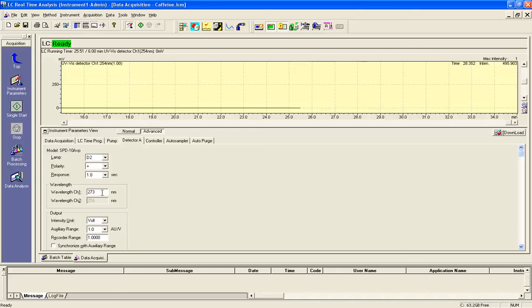Okay, well, if I need to change it, what I do is I just highlight it and I go maybe to 254. And I just key it in. And it's okay. That's all that I need to do for now. You just key it in. So maybe I'm looking for something like benzoic acid instead of caffeine. Well, I take a look at benzoic acid, I look it up on the internet, I look it up in a reference book, and it's going to say benzoic acid's Lambda Max, or its molar absorptivity, is based at 254 nanometer. That is a number that will be given.